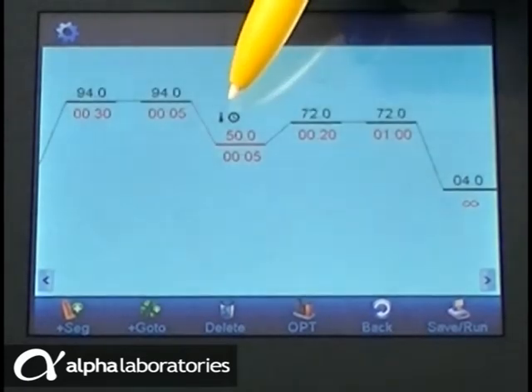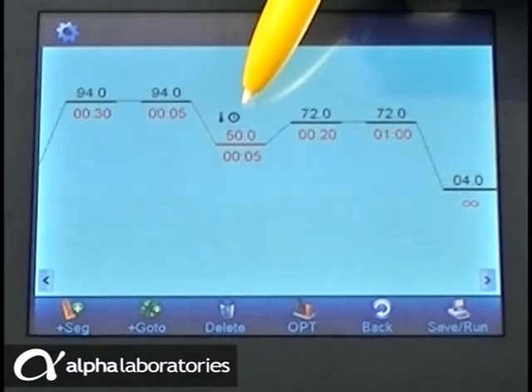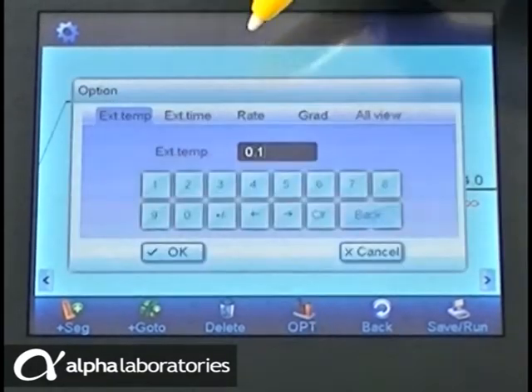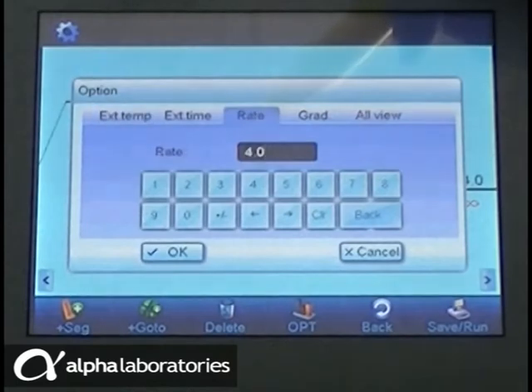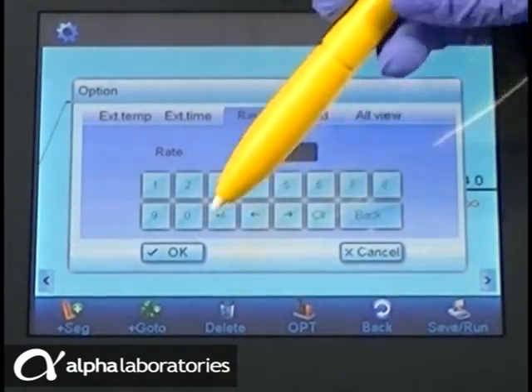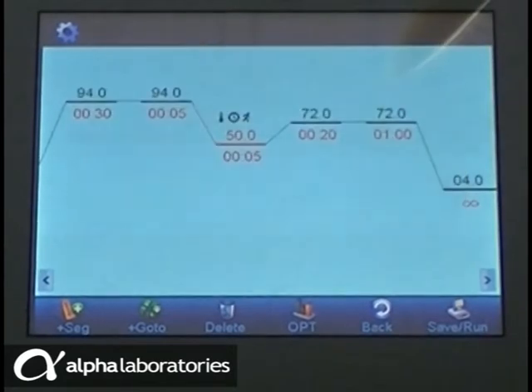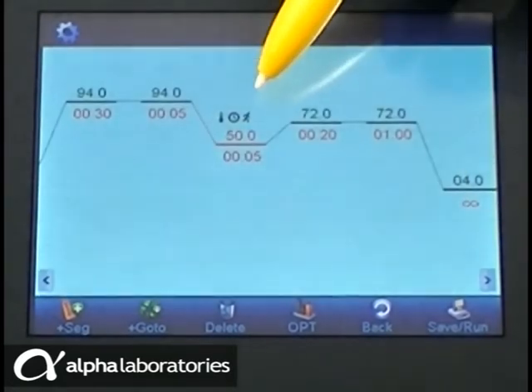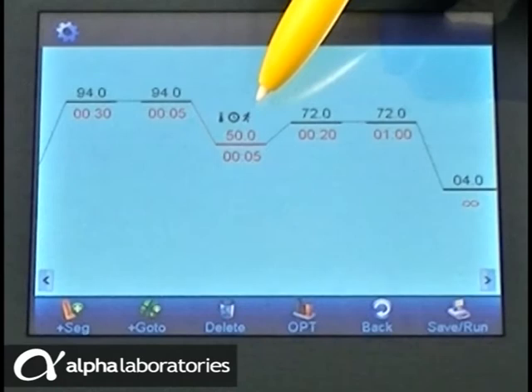When applied, these are indicated by the thermometer and clock symbols on the cycle screen. The heating and cooling ramp rate of the LifeEco block can also be controlled. The maximum is 4 Celsius per second, but you may wish to decrease this. Any alteration is indicated by the little running man symbol.